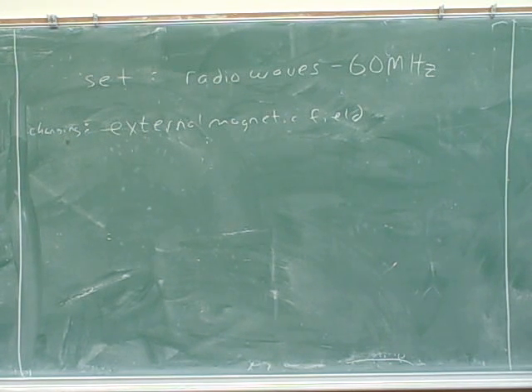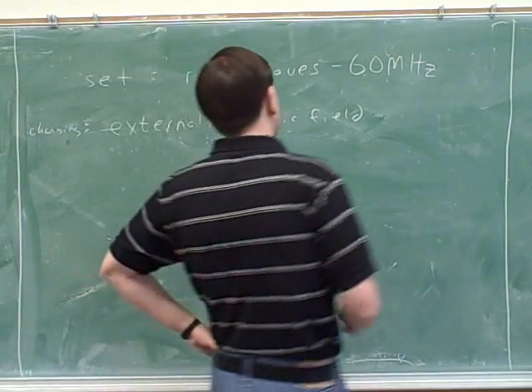What you'll see on your results is, if all the protons were the same, you would only get one peak, only one absorption. But if you have two different sets of protons, then you get two peaks, two absorptions on your printout. That'll clarify in a minute or two when we start looking at some practical examples. So some protons are equivalent and some are different.